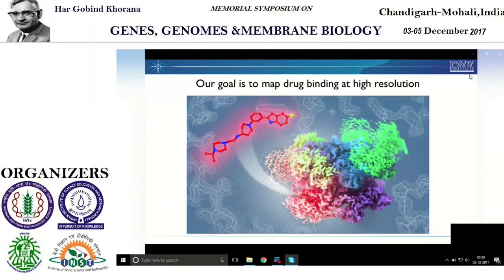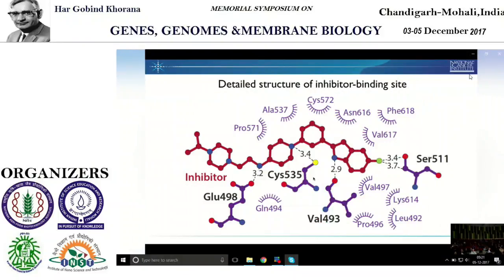But we got very lucky in the sense that we demonstrated that the binding of this molecule freezes the protein in its tracks, and allowed us to determine, as I said before, the very first high-resolution structure by cryo-EM of a small molecule bound to a protein target, and begin to get information on the detailed interactions in the binding site.